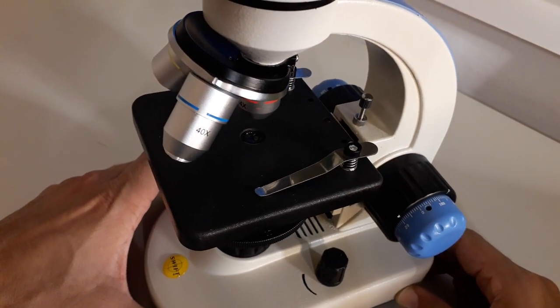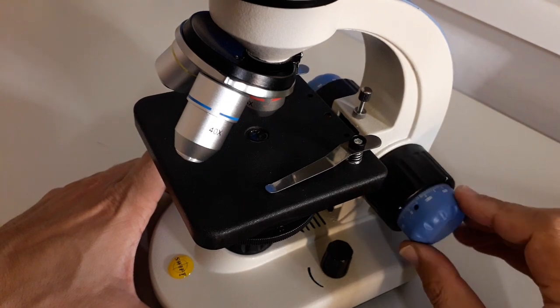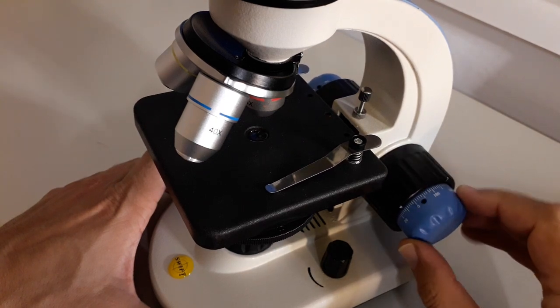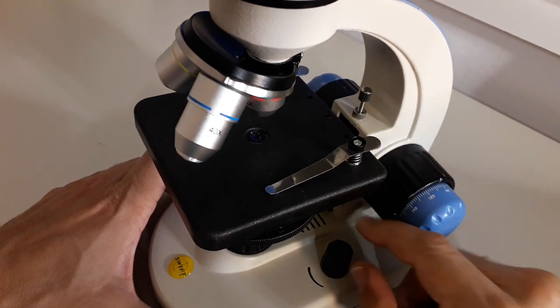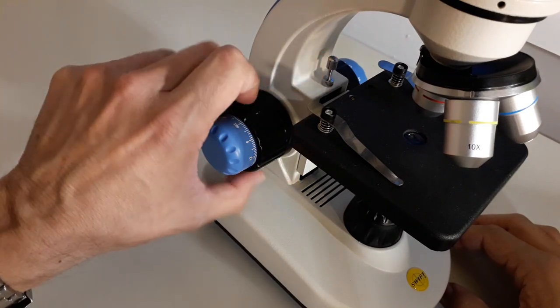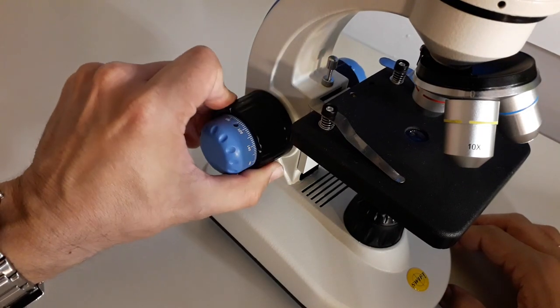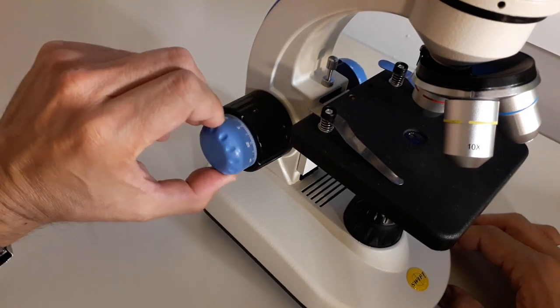And of course, there is also a light intensity control, which can be used to adjust the brightness, okay? And the coarse and fine focus knob again. And that is the light intensity control. And this little screw there is important for making sure that the stage cannot be raised too high.